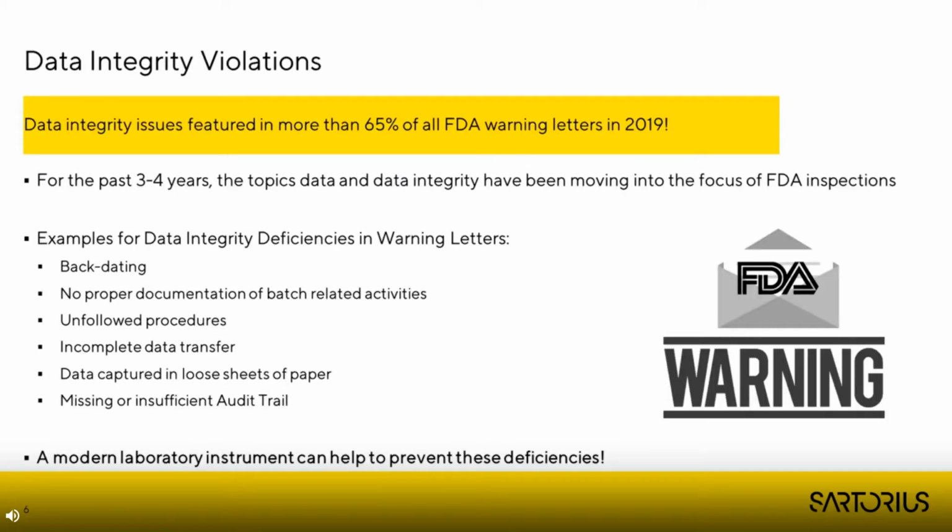How important the topic of data integrity is, we can also see from the listed violations in FDA warning letters, where data integrity issues featured in more than 65% of all letters in 2019.